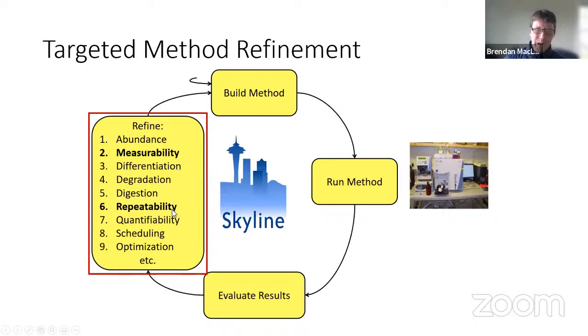We could do more experiments, and the more prior knowledge you build up of your samples and of the things you're trying to measure, like, does it experience degradation, digestion? Does it behave linearly? We've done all of these on very targeted samples.